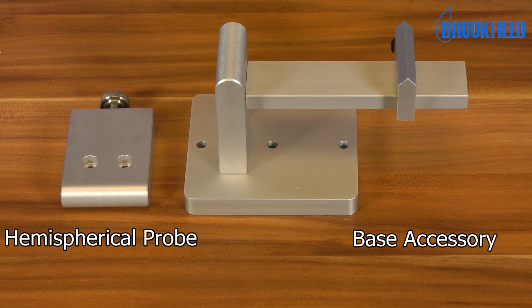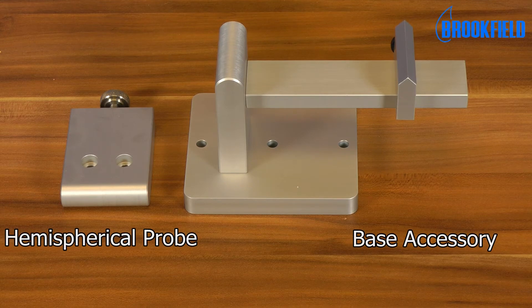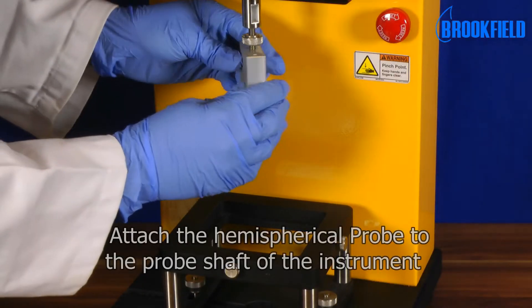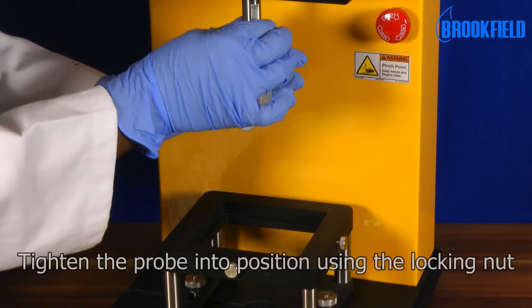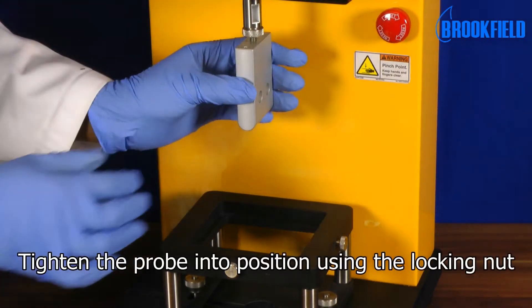Here you see the individual parts of the accessory. To set up the test, attach the hemispherical probe to the probe shaft of the instrument and tighten the probe into position using the locking nut.